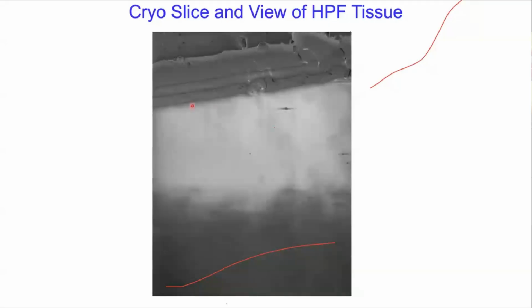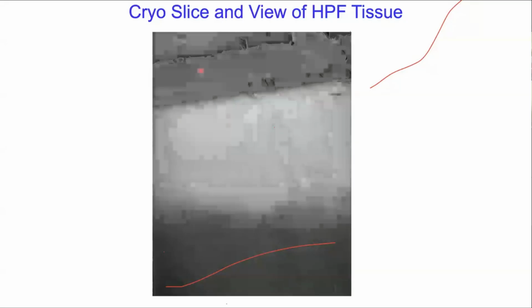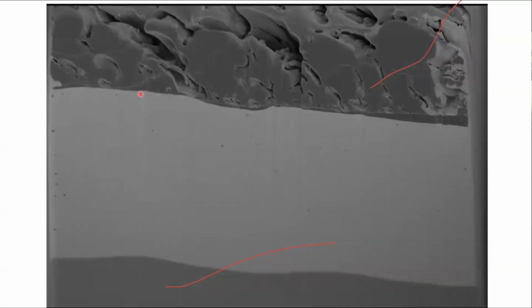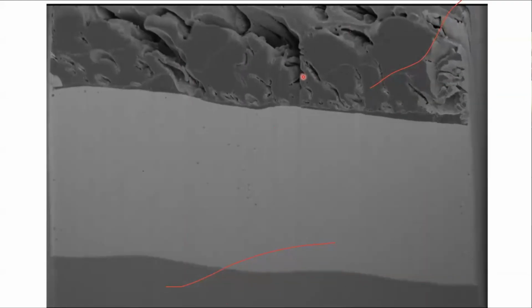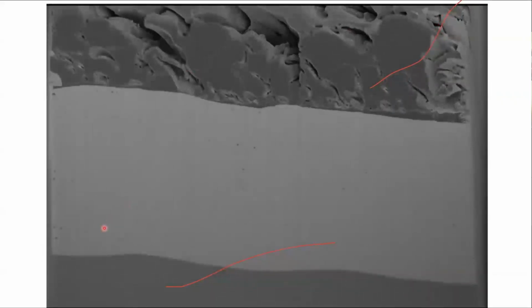This layer is very, very important to make once you put it in. When it's sputtered, then GIS, then sputtering. So we have done 5-layer GIS and sputtering. And each sample needs to be standardized. Later we can get a little better image, but still here you can see the second sputter line is not very good. It's very uneven and not smooth. So again, we are not going to get very good data.